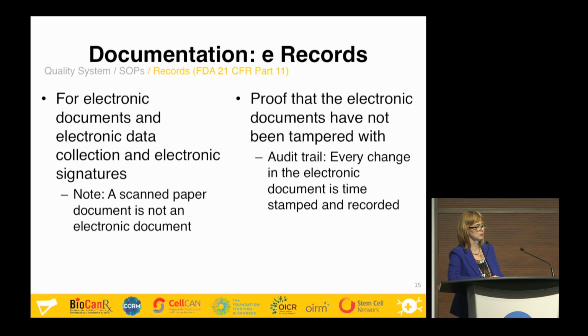with. This means that your software has been validated, that there is no means that you can falsify the data, by accident or otherwise. And also the principle that you need to know every change that has been done is implemented with something called the audit trail, where every change in the electronic document and data is timestamped and recorded by the software and kept in a file that you can review, and you can see at what time a change was made and by which signed-in operator the change was made.